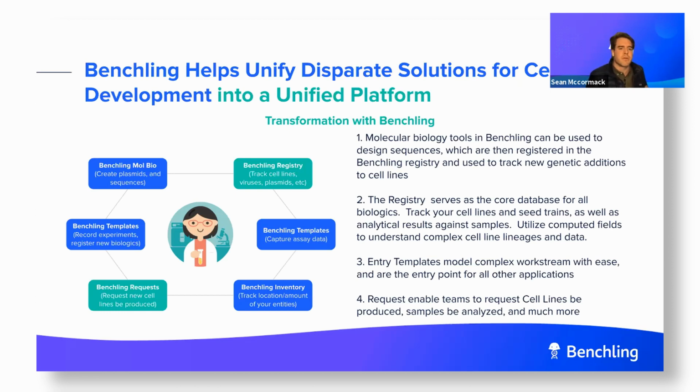You can use templates to record your experiments as opposed to your ELN, but you can also just have standard notebook entries where you can start an experiment from scratch. If you have processes that you're doing over and over again, we do encourage you to use templates because you can set up the experiment, take out the grunt work of setting that experiment up in your notebook each day and just record the pertinent data. We can also use our templates to capture assay data.